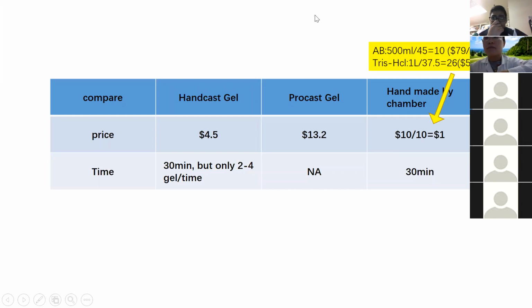Dr. Meng, I have one question. You showed the video with the 4% and 20%, right? What kind of mixer is that? Where can we buy that mixer? You connected a tube in the video. What do you mean, which part can you buy? You showed the chamber, 4% and 20%. That one I want to buy. Which vendor will I buy from?